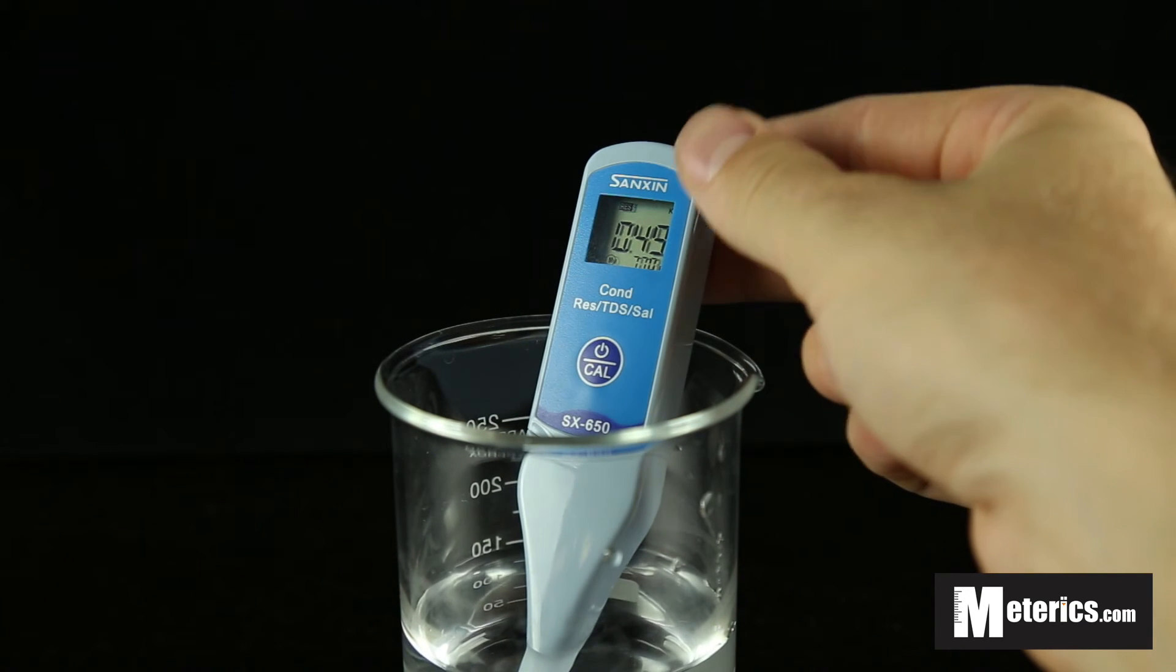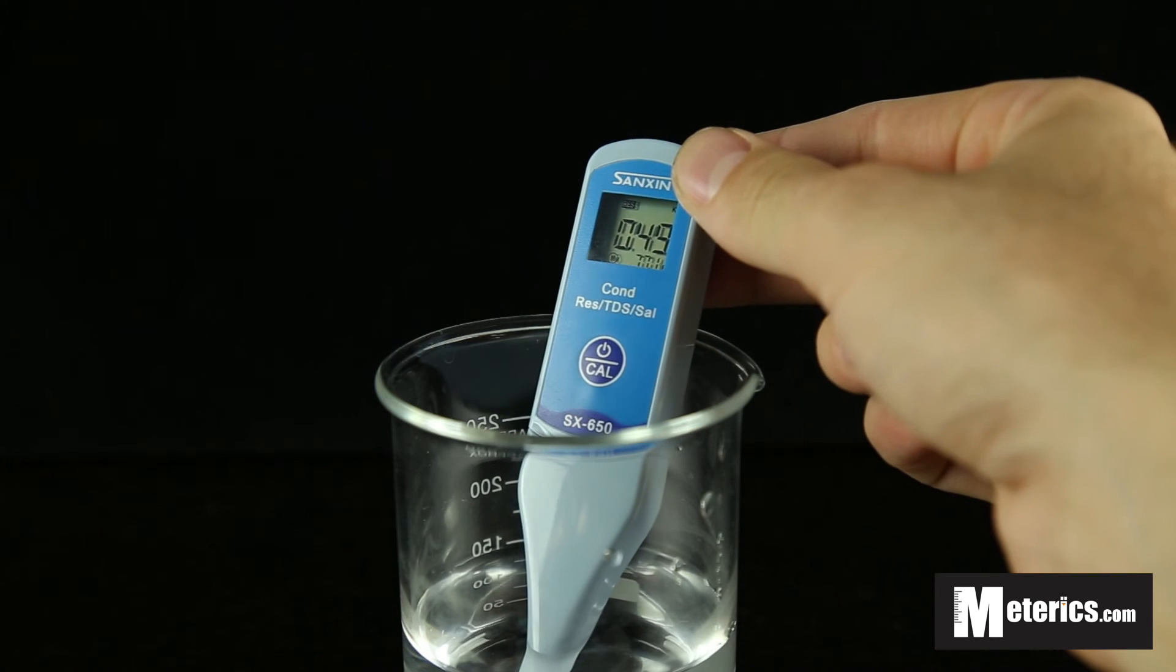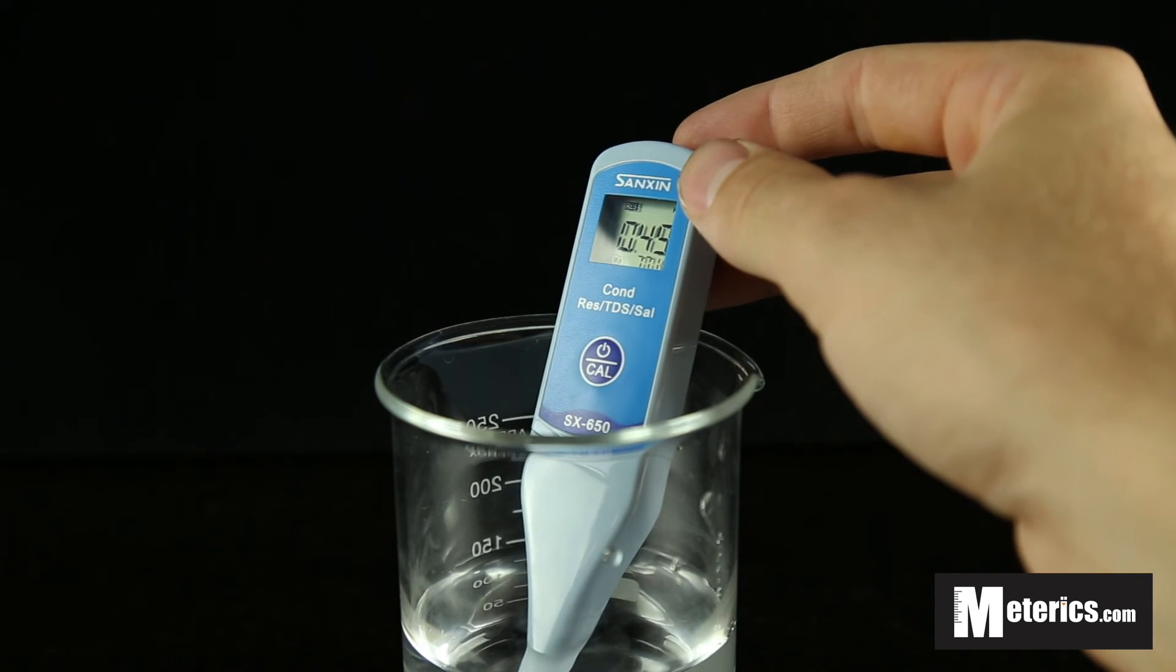It's also the calibration button, but we're not going to be calibrating this meter today. I just wanted to show you how to switch between modes and turn it on and off.